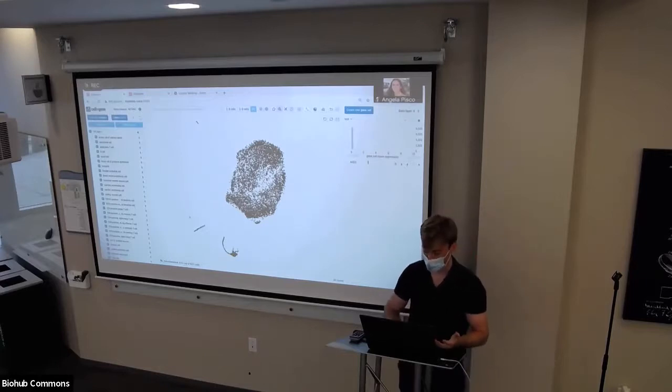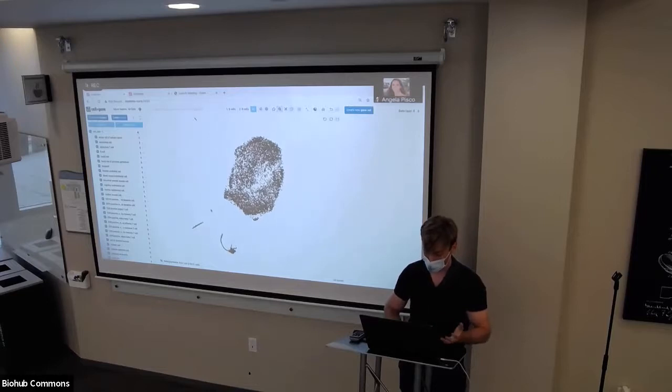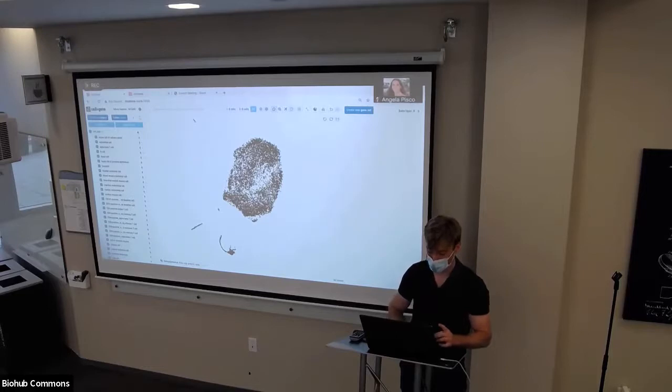And we can actually do marker gene identification here. I'm going to show you how to do that, but first of all, I want to show you a couple other buttons I added that are really important for massive data sets.